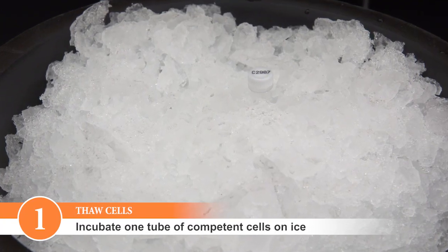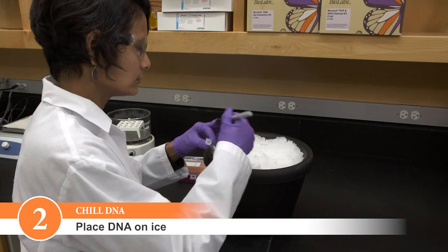Thaw one tube of competent cells on ice. Place DNA on ice.